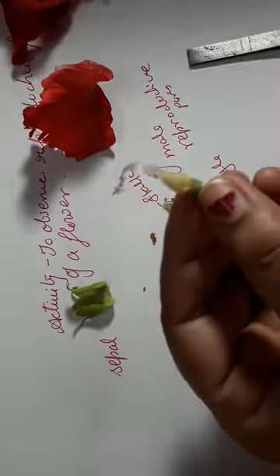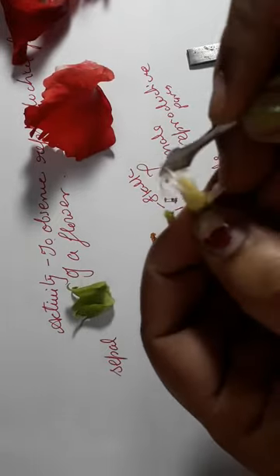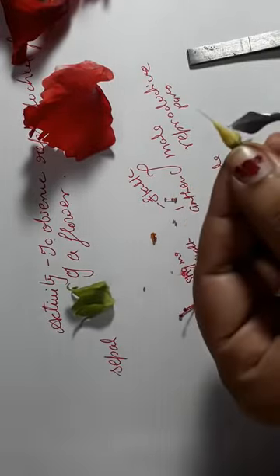I will take the help of this instrument. This is the ovary section which you are observing, right? So this is the perfect ovary.